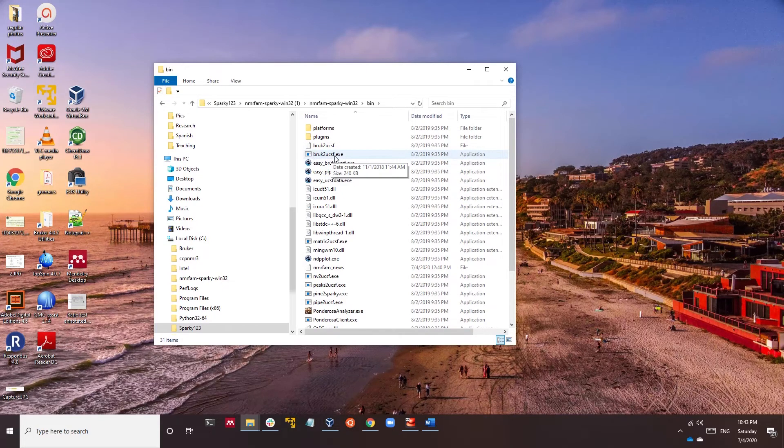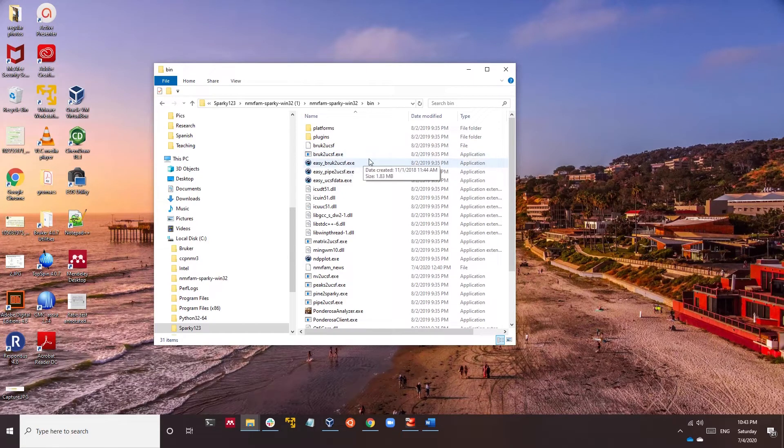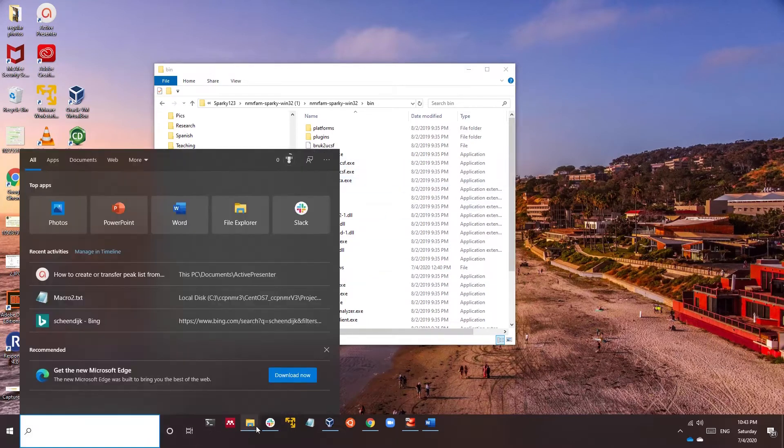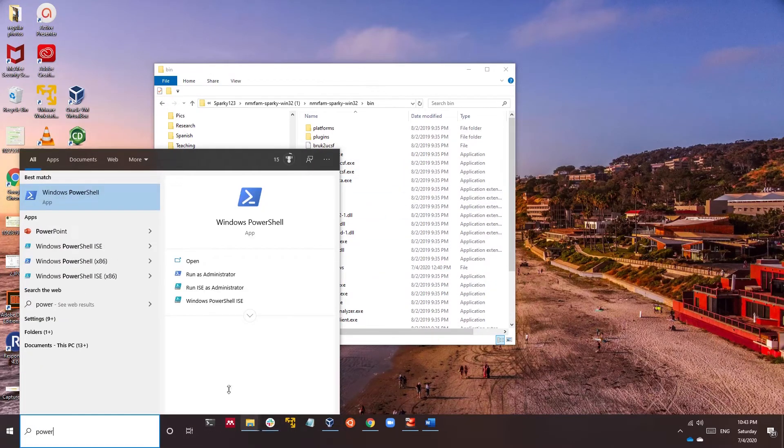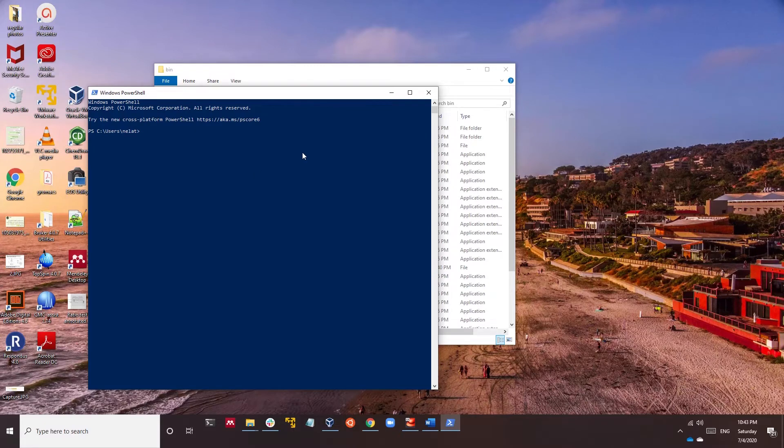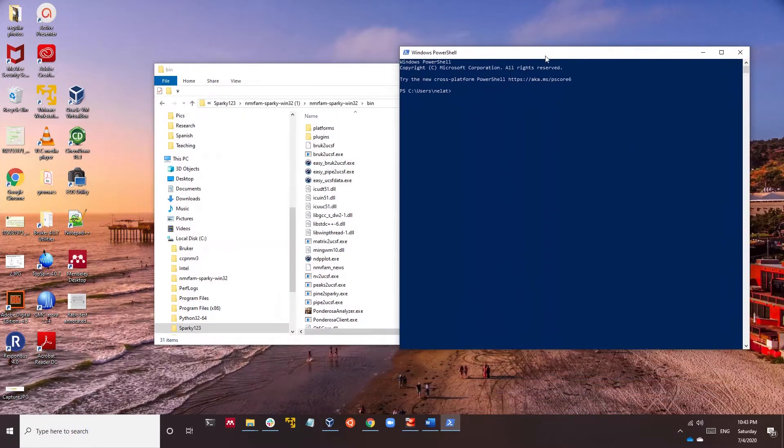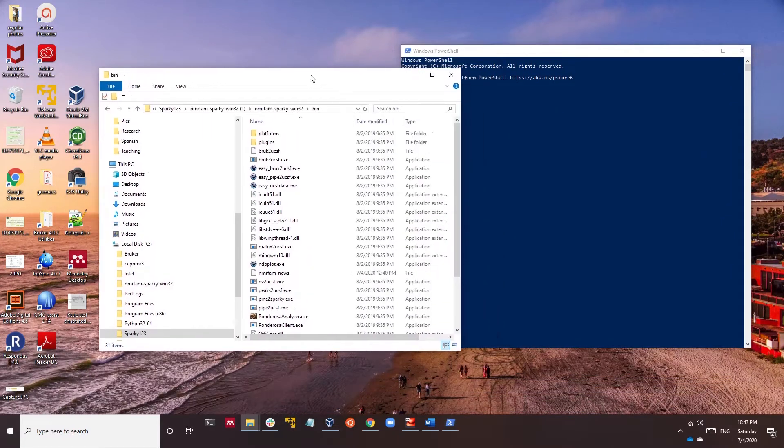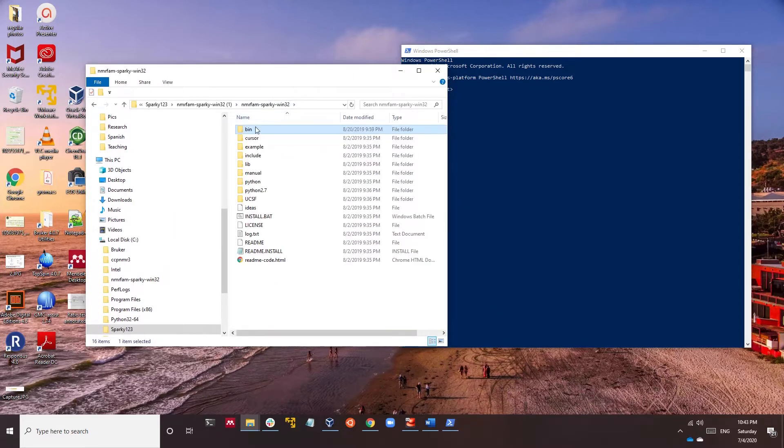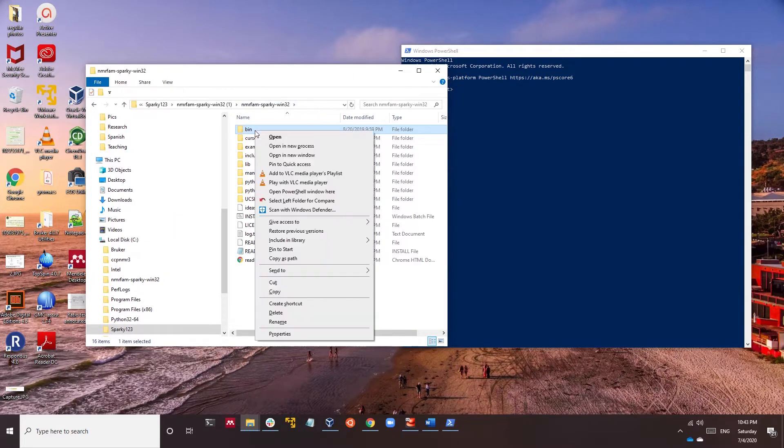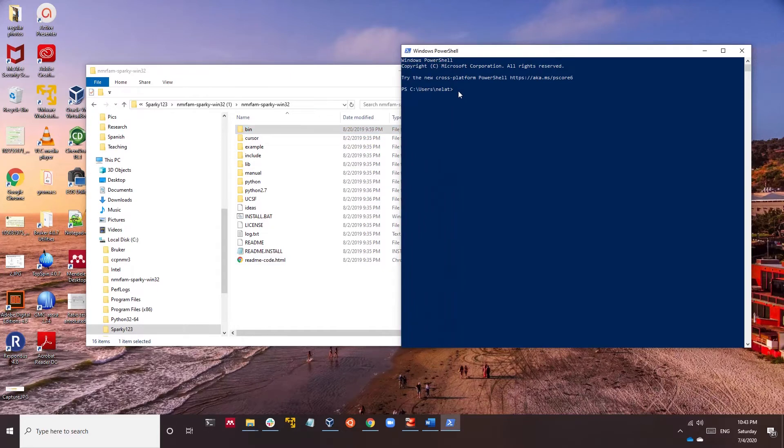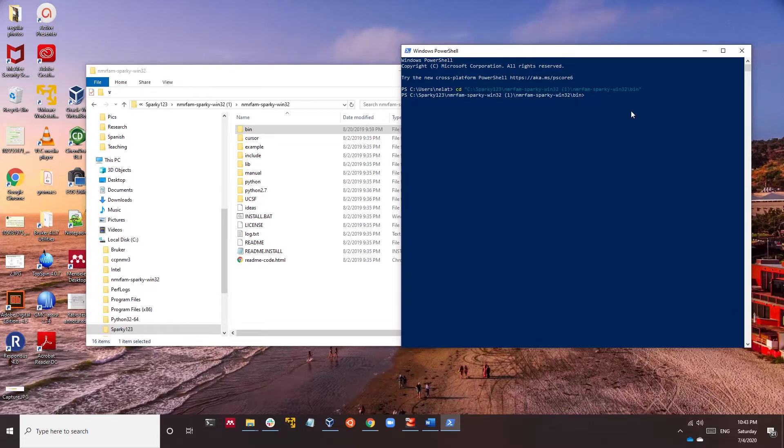It's called bruker2ucsf.exe. So we're going to go to the PowerShell if you are a Windows user, and we're going to locate this bin folder. You can hold Shift and then do copy as path.